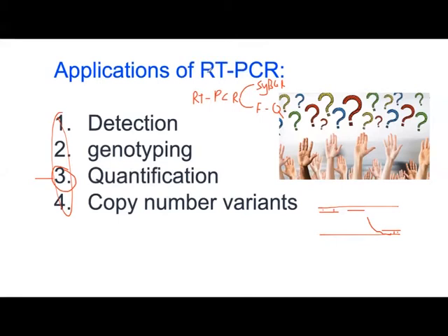Now, however, RNA is not very stable, and we have problems if people ship RNA to us, or we also sometimes ship RNA.